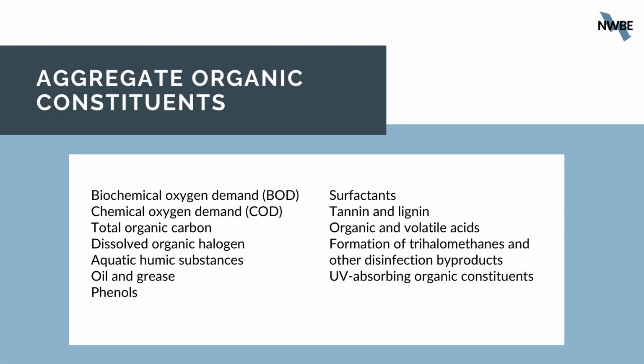So moving on to the next class of methods, I wanted to talk about the aggregate organic constituents, most notably biochemical oxygen demand, or BOD, and chemical oxygen demand, or COD. Both of these measurements are getting at the same thing, the amount of biodegradable organic matter in the sample expressed as oxygen demand. So it's worth talking about what exactly oxygen demand is before we get into more details about the BOD and COD tests.